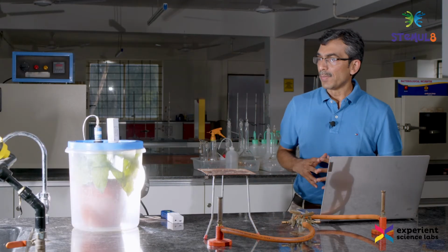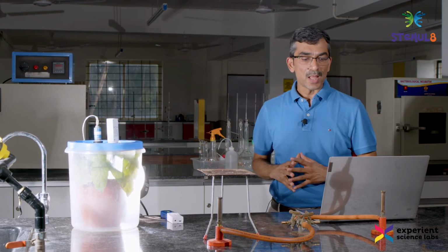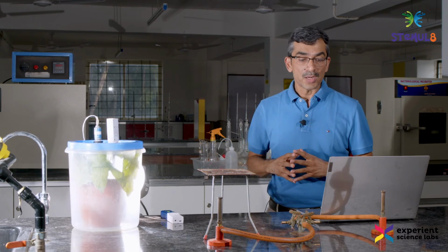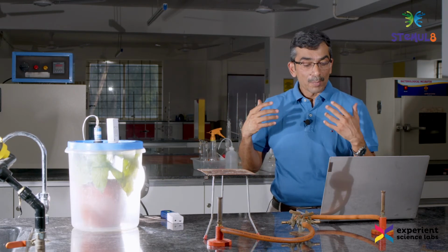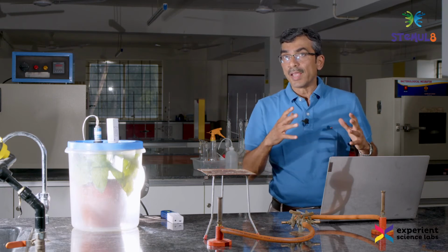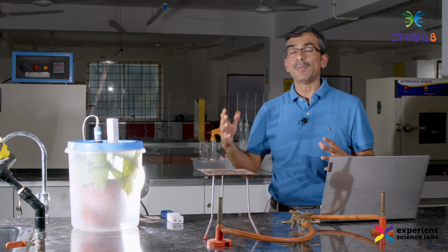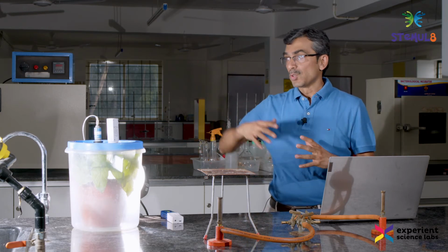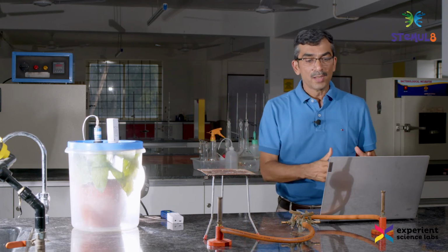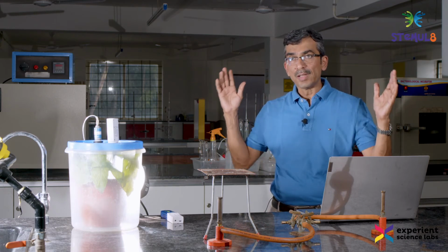Now as a next step, I am going to do something more interesting. I am going to shut off all these lights and then once again look at what happens to the carbon dioxide level. Does it increase? What happens to the oxygen level? We will let the sensors keep accumulating the data, because it takes time for conditions to stabilize. When we switch off the light, it will take some time for us to get the data, but we will look at the data in a continuous mode. Let the data recording go on, let the lights be off.